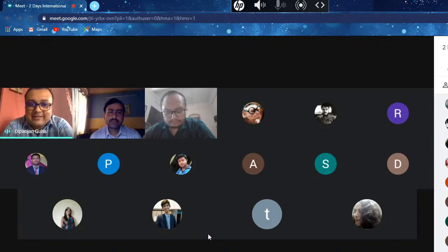From this morning, Dr. Bhattacharya talked about some specific applications of the confocal microscope. He also showed how co-localization and similar things can easily be detected using a super resolution or confocal microscopy platform. Then Dr. Matthew came and made us learn the ample amount of applications a confocal microscope can do.